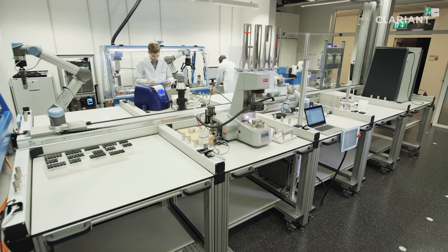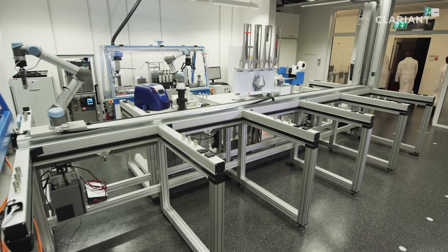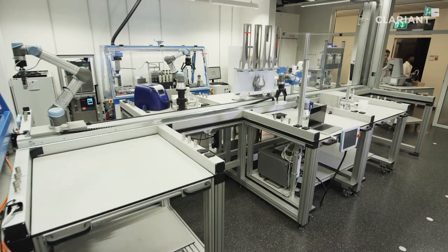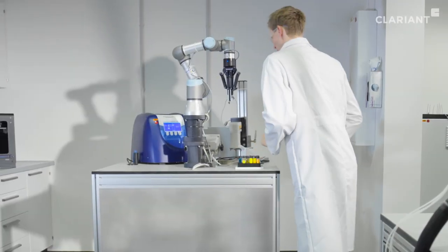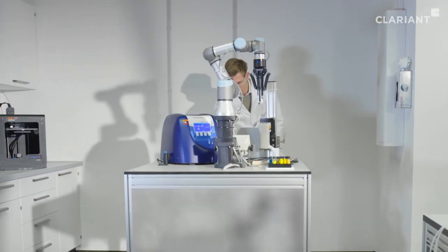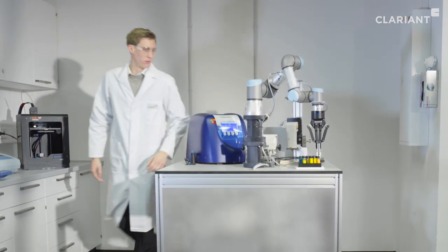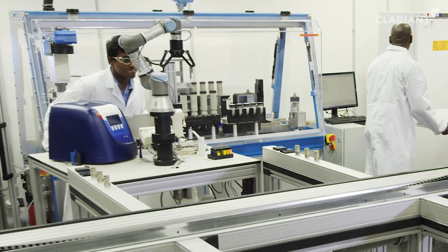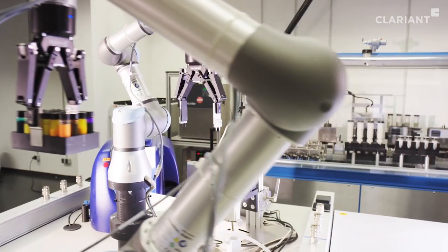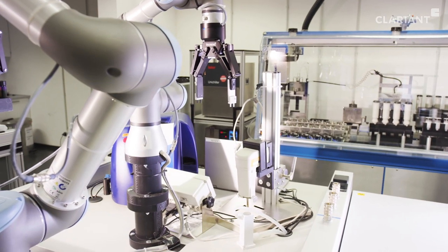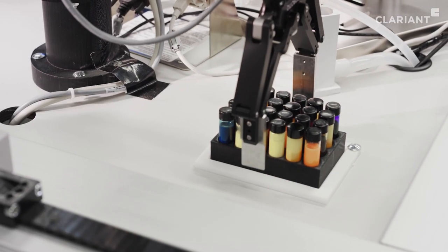Our application and testing platform is designed as a universal docking station for specialized workstations. These workstations are integrated with various tools needed to perform specific tasks. They can operate independently where a person delivers a set of samples or in fully automated mode as part of a more complex protocol. Simply docking the required workstations allows one to quickly build a customized platform required for each project.